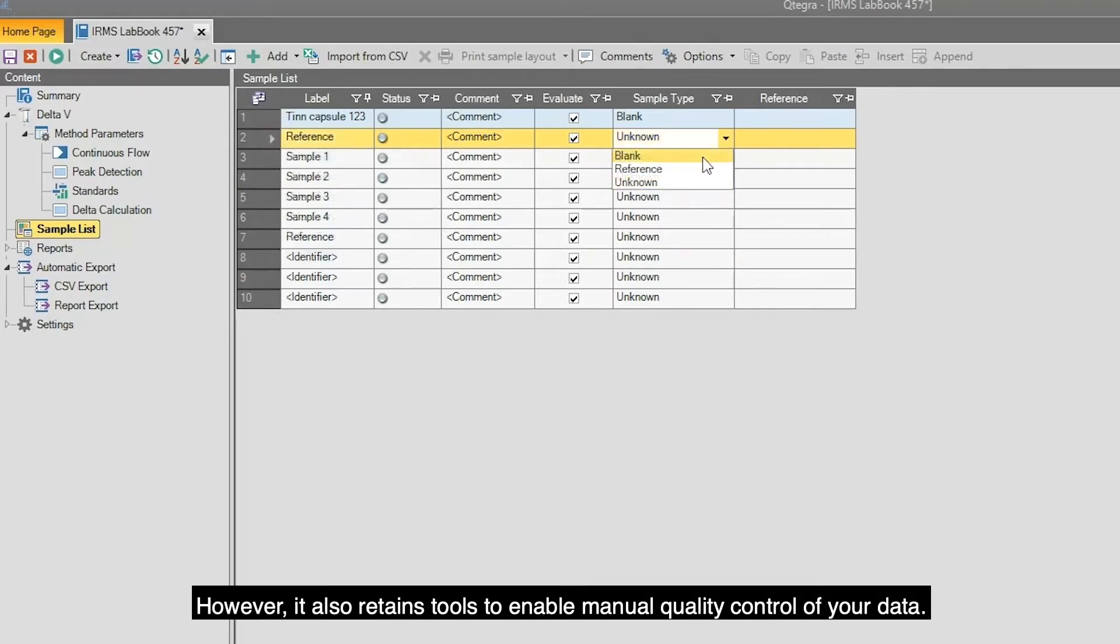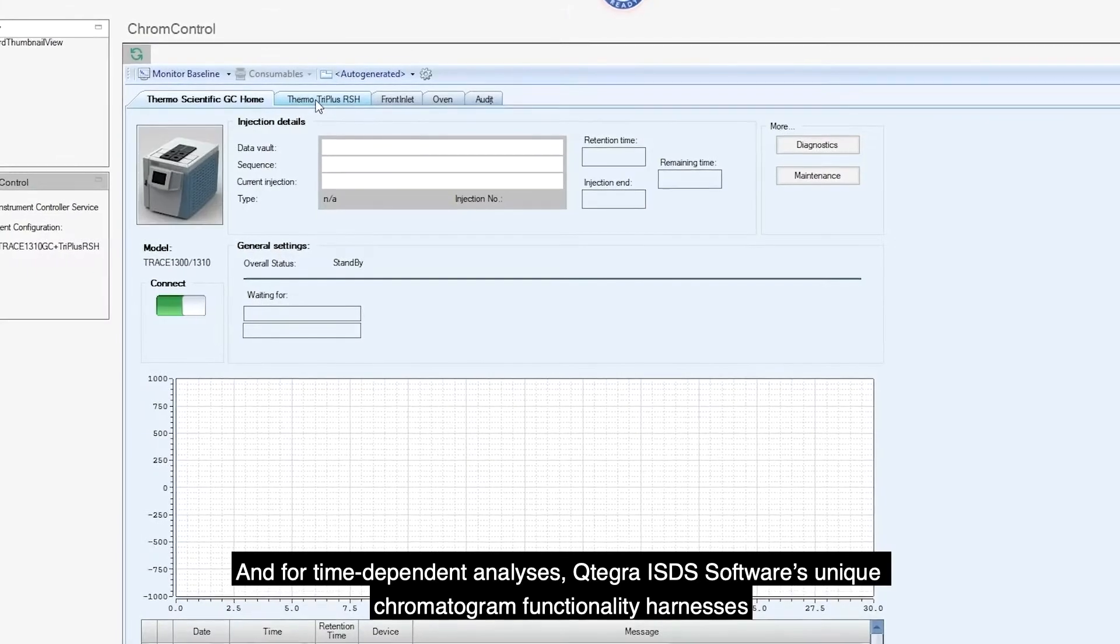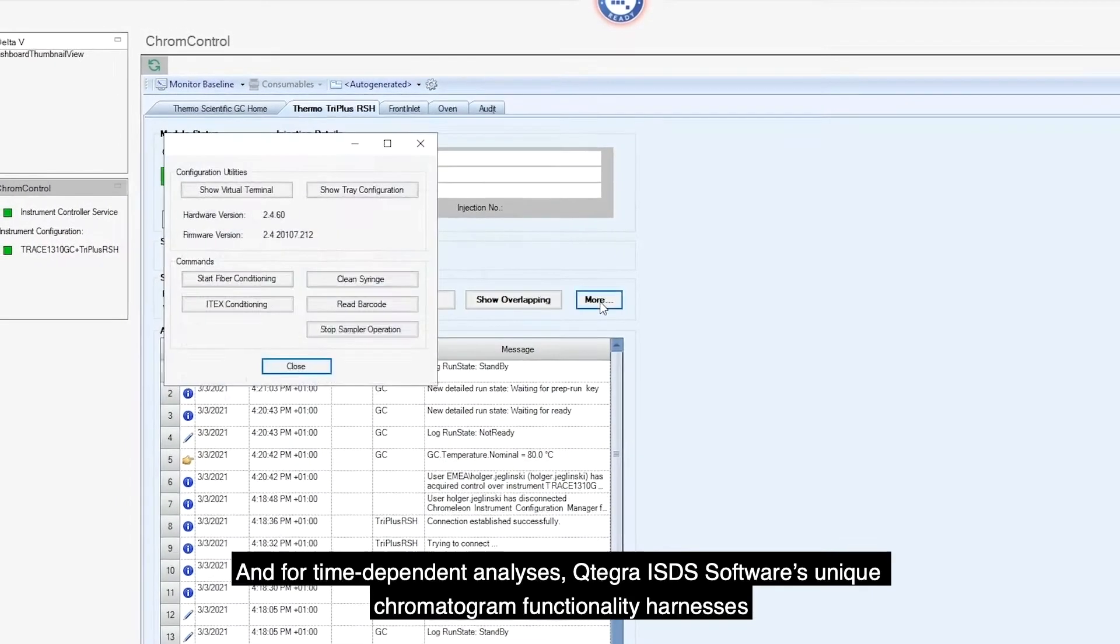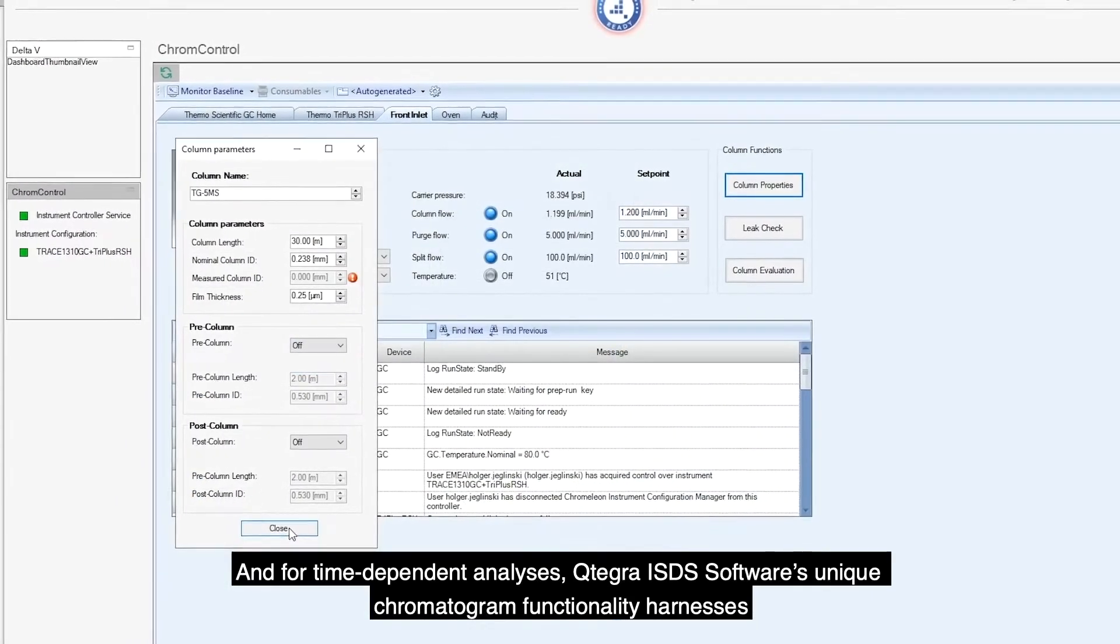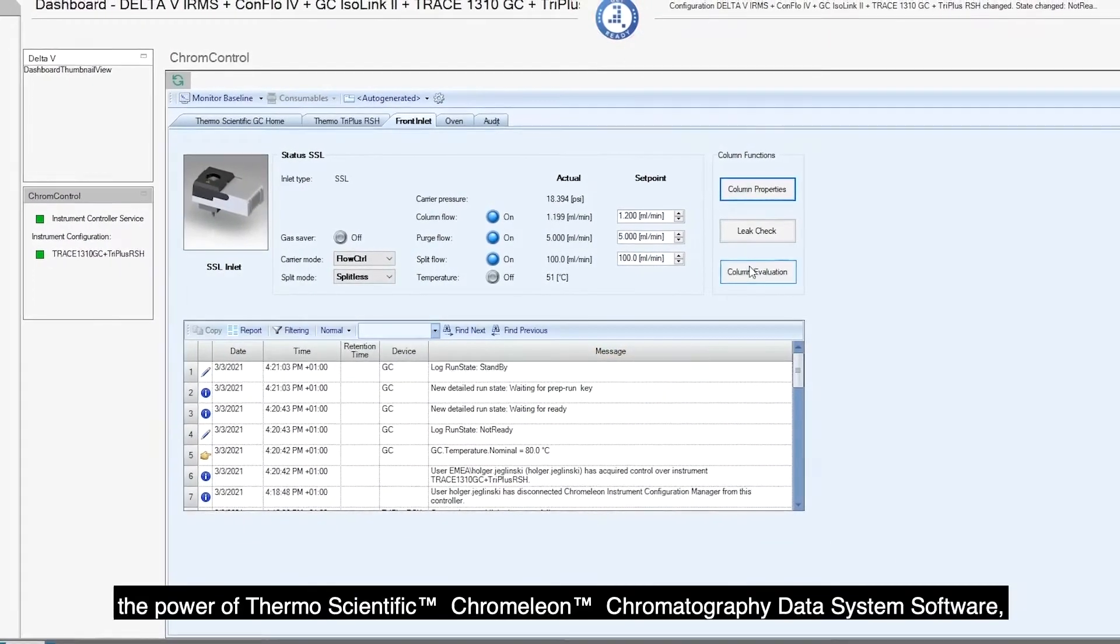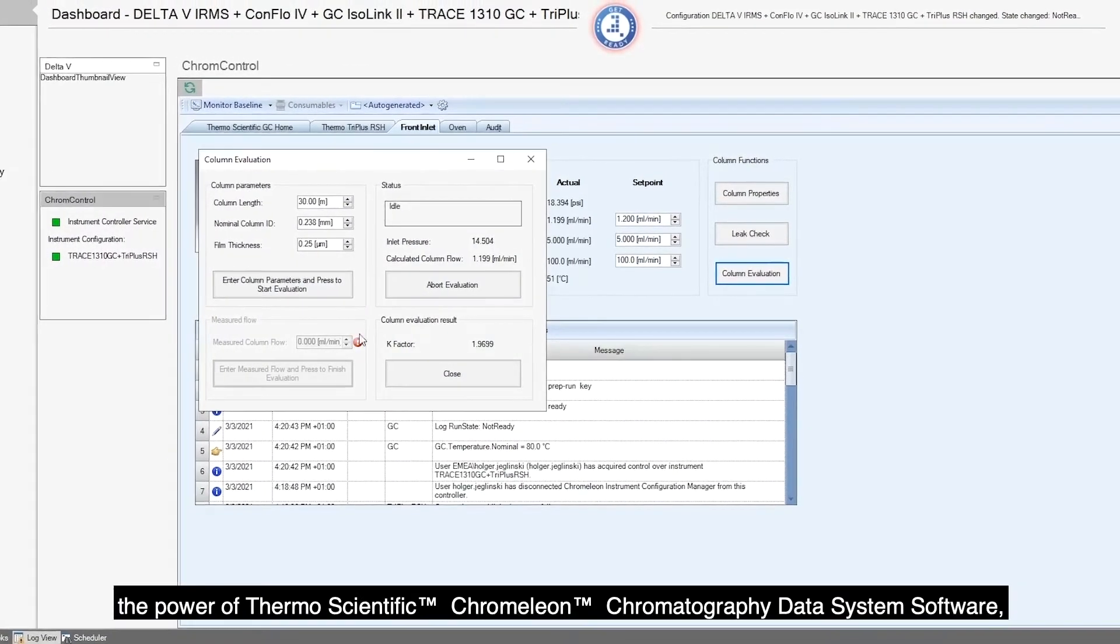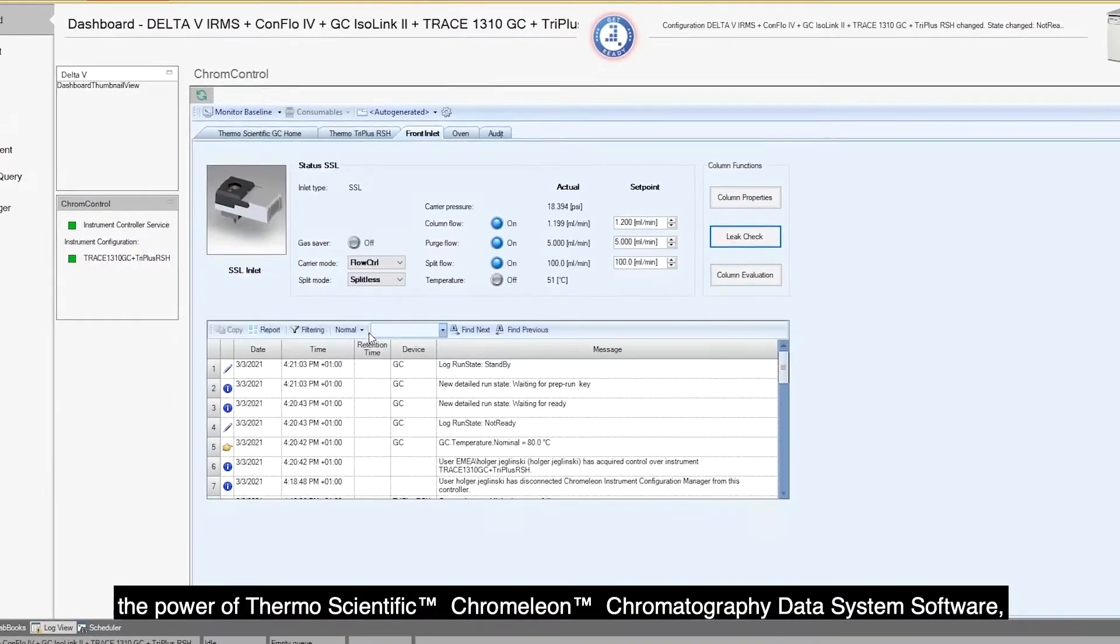However, it also retains tools to enable manual quality control of your data. And for time-dependent analysis, Qtegra ISDS Software's unique chromatogram functionality harnesses the power of Thermo Scientific Chromeleon Chromatography Data System Software, providing all you need for your research in one place.